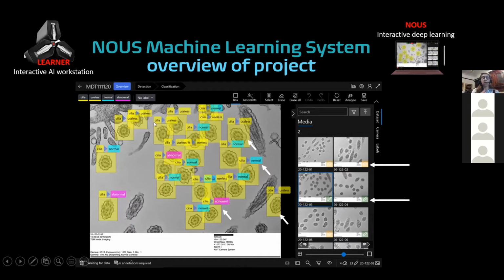All the yellows are cilia that are either too close to the cell and they are just very proximal, so they don't have exactly the components we are looking for, or they are tilted or fuzzy and out of plane, and we don't usually analyze those. But this is how it would look.